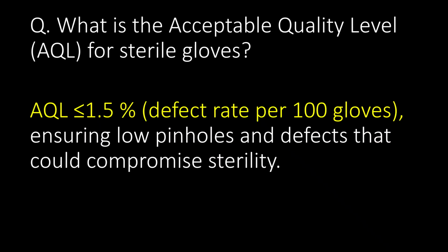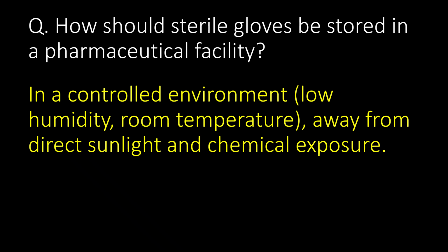What is the acceptable quality level, that is AQL, for sterile gloves? AQL, that is less than or equal to 1.5% defect rate per 100 gloves, ensuring low pinholes and defects that could compromise sterility. How should sterile gloves be stored in a pharmaceutical facility?